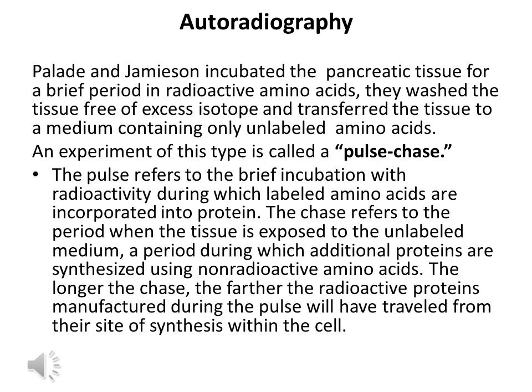Autoradiography is the earliest technique used to elucidate the function of the endomembrane system. Palade and Jamieson incubated pancreatic tissue in radioactive amino acid, so that the proteins synthesized in the tissue would be radioactive. Then they transferred it to normal amino acid medium. This experiment is known as pulse chase. In the pulse, the radioactive amino acid gets incorporated into the protein. The proteins synthesized during the chase contain non-radioactive amino acids.